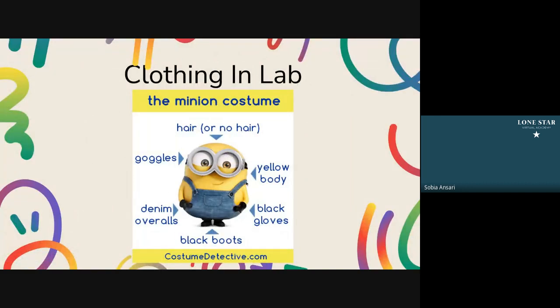So you can use this minion as an example. If you have hair, it needs to be tied back. If you don't have hair, perfect, it doesn't need to be tied back. You need to be wearing safety goggles anytime you're working with chemicals, anytime you're working with heat, any of this dangerous kind of stuff, you need to be wearing safety goggles.